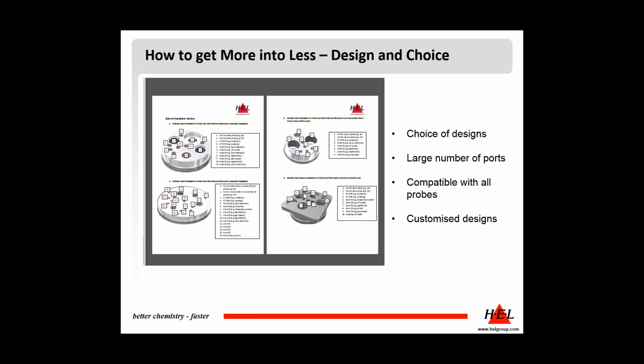One of the key design areas is to ensure that we can get as much information out of the reactors as possible, and one important facet of that is to make sure there's a range of head plates we can use with the vessels in order to accommodate different probe types, different feeds and gases and so on and so forth.